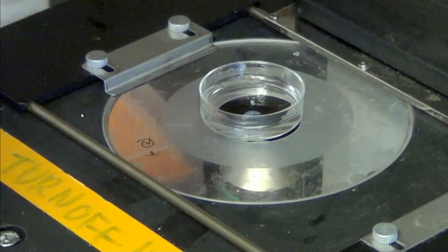I'll transfer them to a 100 millimeter dish with about 25 mils of Hanks balanced salt solution, and I'll transfer all the slices. Then you can take a slice out and put it into a smaller petri dish, or into a 6-well, 12-well or 24-well plate, whichever you choose, and look at it under the microscope. Look at the quality of the slice and how clean it is, and whether you have nice smooth muscle rings and they look healthy.